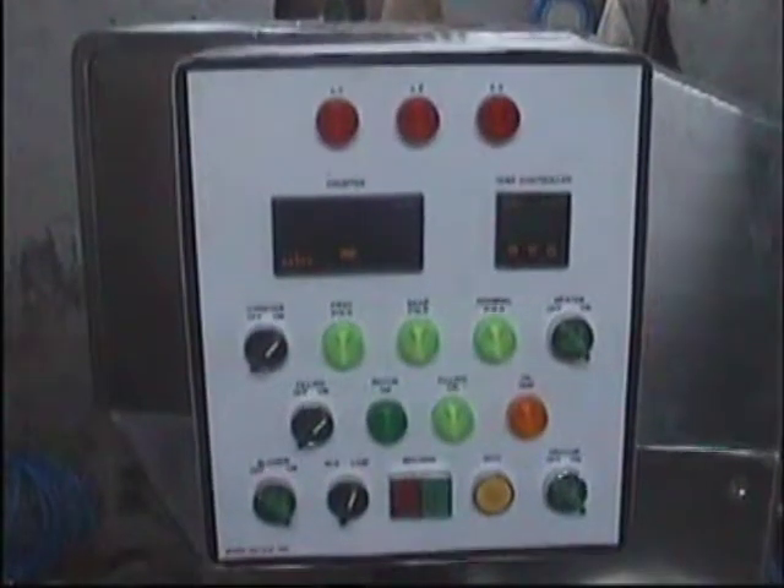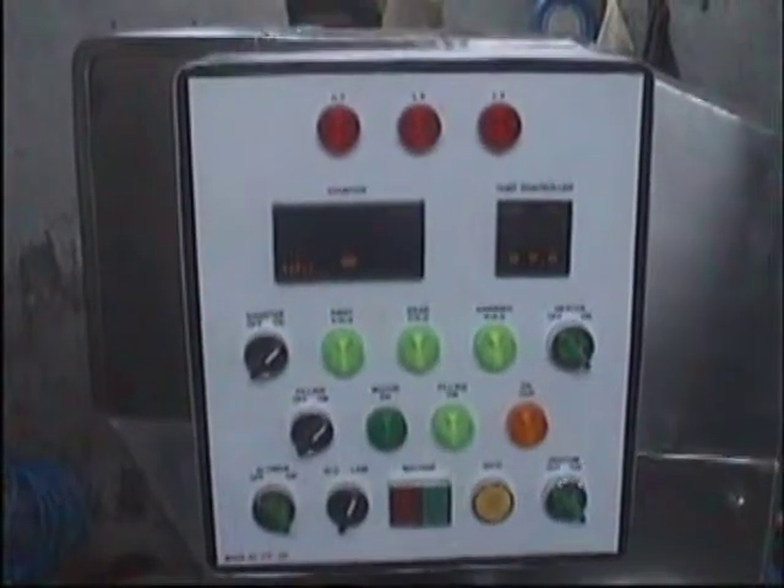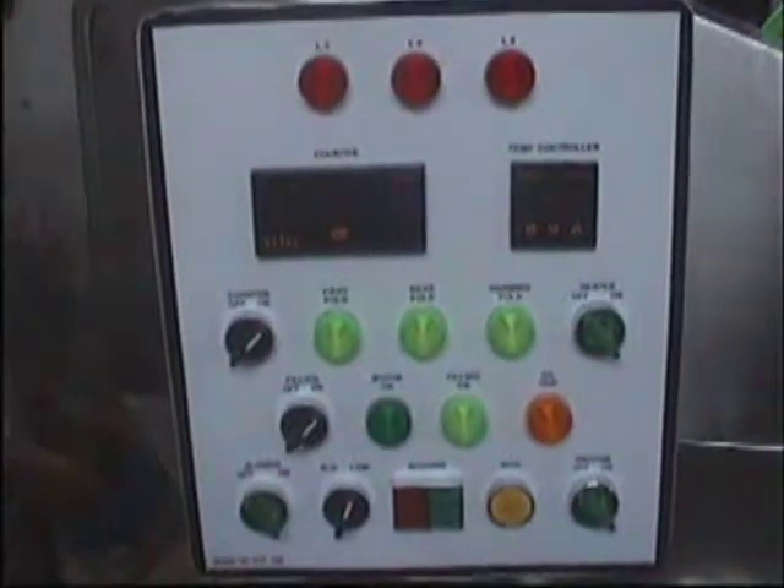This machine can fill both lami as well as aluminium tubes. This is the control panel of the machine.